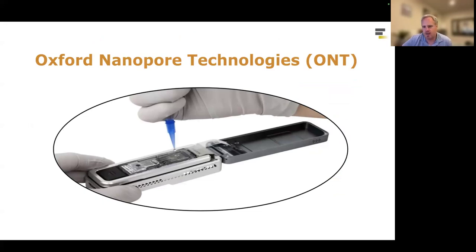Ultra-long means that we're going to be specifically targeting reads that are 100,000 base pairs or longer. Whereas hi-fi reads tend to max out at about 15 kb, here we're specifically targeting reads that are 100,000 base pairs or longer. So you get the equivalent of, I don't know, eight or so hi-fi reads assembled back to back to back in a single Oxford Nanopore read coming out.